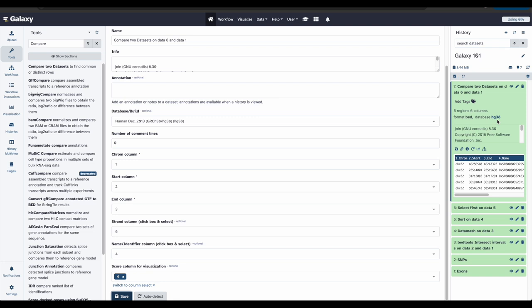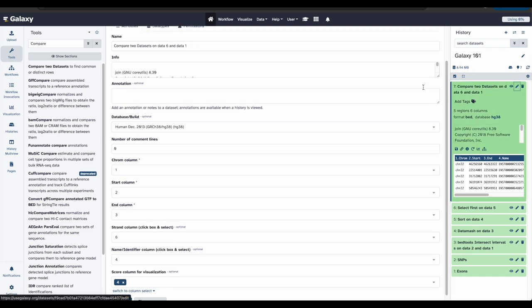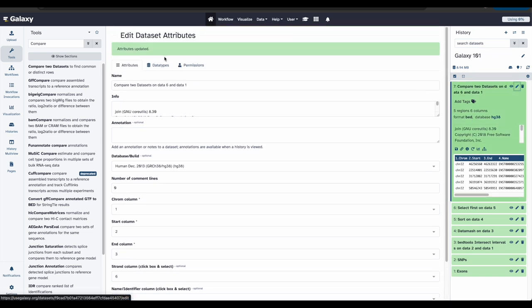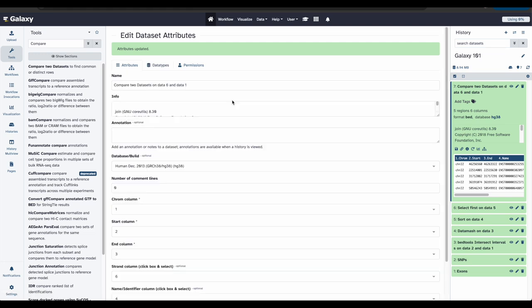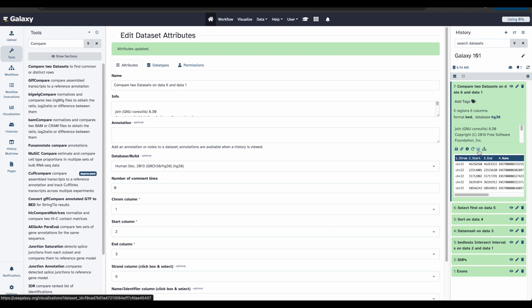Second, we need to check that the format of our latest history data set is BED. Right now, it is BED. If it wasn't, we would need to update this. Once again, go through the pencil icon, go over to data types, and we would change this to BED. Now, let's go back to our history where our data set is still expanded. We want to click the visualize icon, which is right here. It kind of looks like a bar graph.